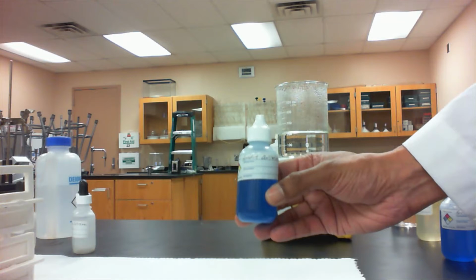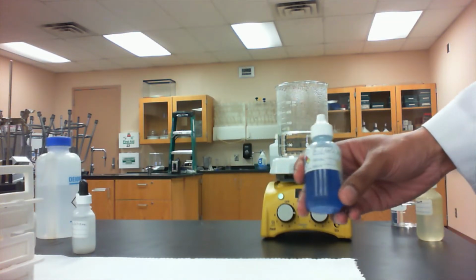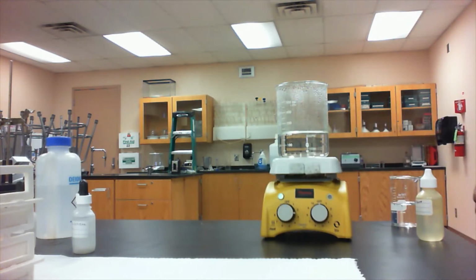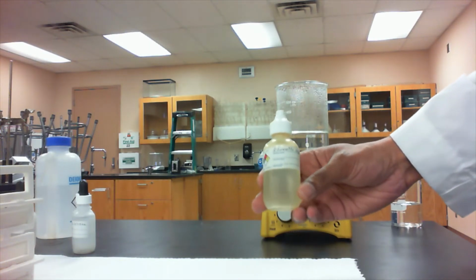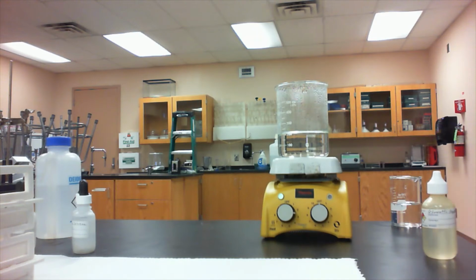So the 3 tests that we're going to be doing are tests using the Benedict's reagent, which has a blue color associated with it. We're also going to be doing a test using the Barfoed's reagent, which also has a blue color. And the 3rd test involves the use of Seliwanoff's reagent, which is a little bit more colorless.